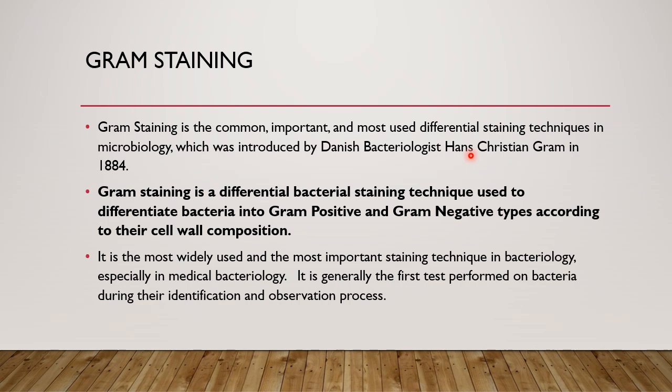It is one of the most commonly used staining methods, followed in most microbiological and bacteriological laboratories, and it is the basic one. I think all bacteriologists will know what gram staining is, and they would be very familiar in doing it. This was introduced by Danish bacteriologist Hans Christian Gram in 1884. And this gram staining is a differential bacterial staining technique.